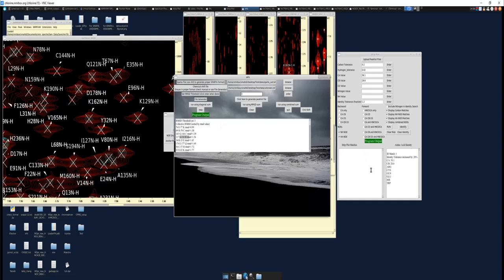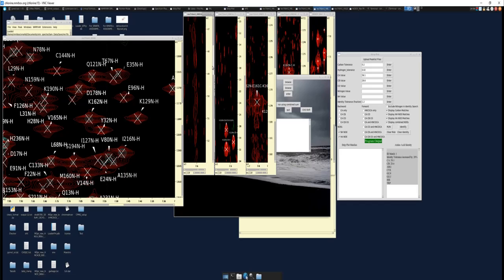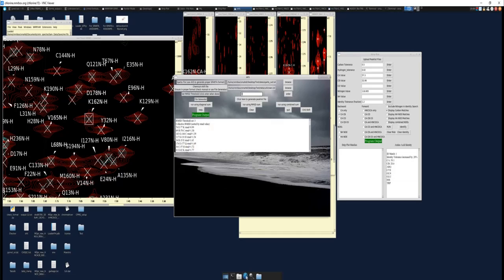But this can be a very useful tool just with this identifier. And you can use this strip plot. So let's say we've gone through 2 and we have so many matches, it's not definitive. So let's use the strip plot to see if we can find the I-1 of this amino acid so we can add more information to our table, right?